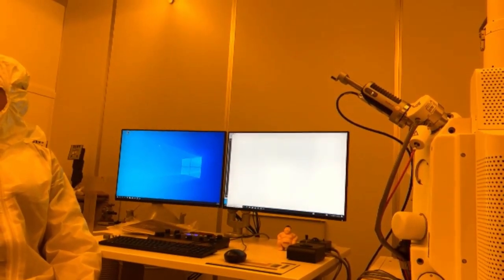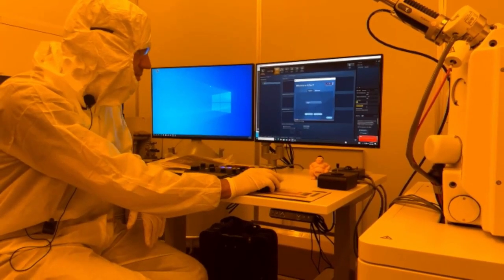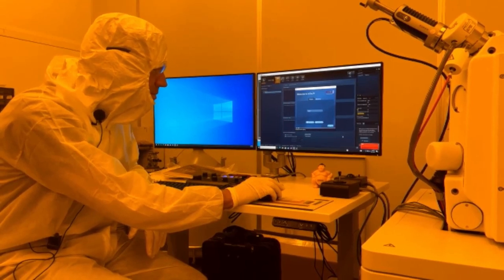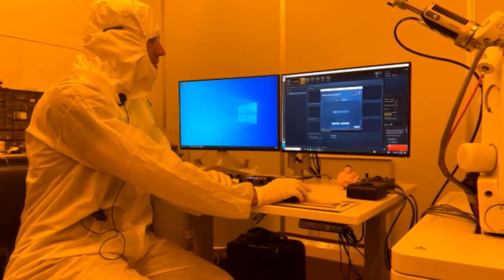Did you just turn it on? Or is it that one we leave on? At the end of the day, when we turn off the computer and the system, that's always still on? Yes, leave that on still. Yes, leave the Oxford box on.